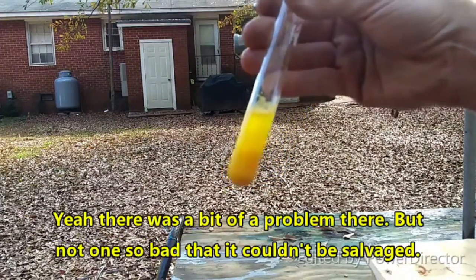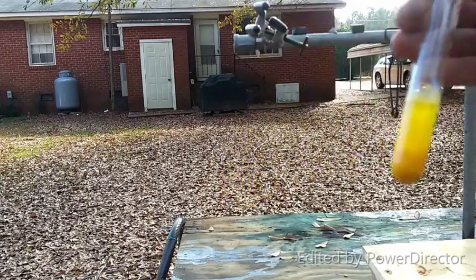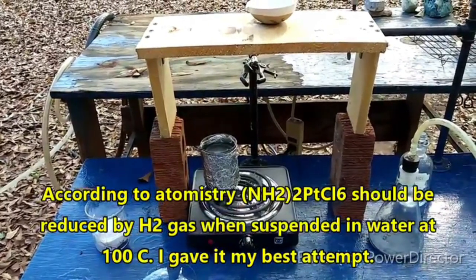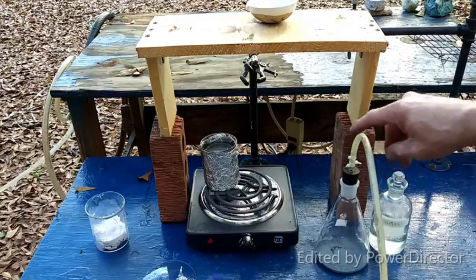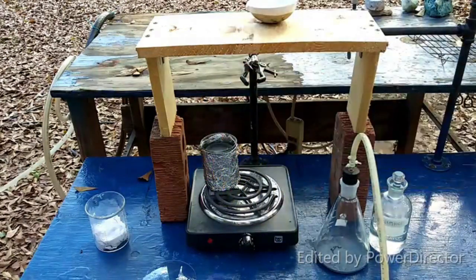So, what I'm going to do with this is I'm going to take and put this one in a boiling water bath. Bring it back and show you what I've got here. I have a flask here that has some zinc dust in it, and I'm going to add some hydrochloric acid to that and generate hydrogen, and I'm going to bubble hydrogen through the tube while it is immersed in the boiling water. I'm going to start once it hits 100°C. And then we'll let that go for a little while, and we should produce platinum black.